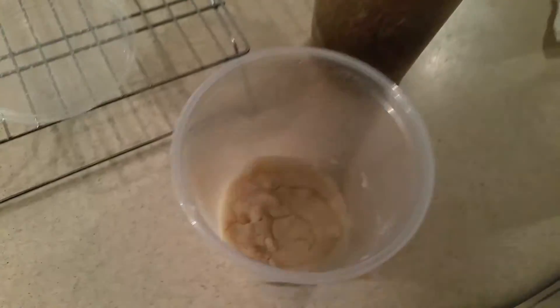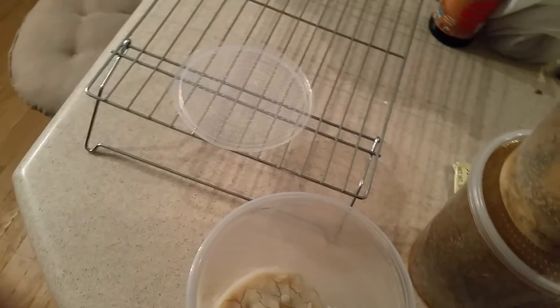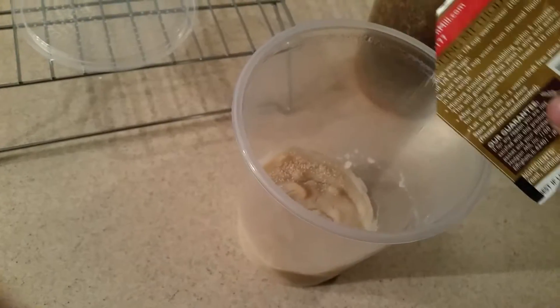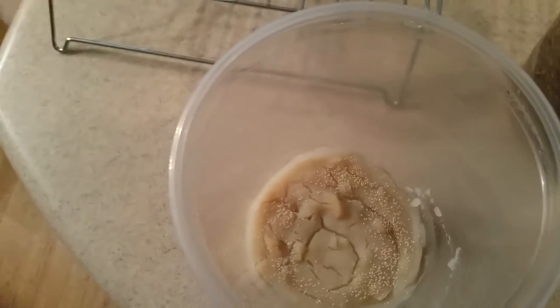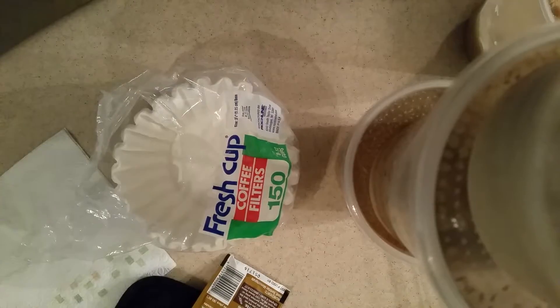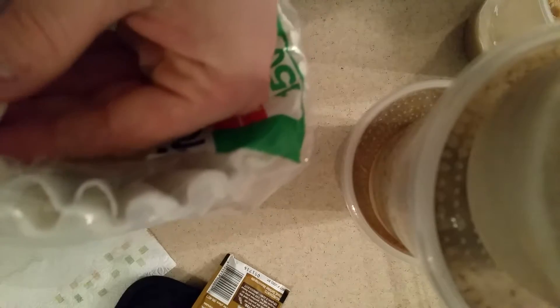Now we have the culture and the lid condensation free. What I do now is I get some active dry yeast and sprinkle it just on the edges, not in the center, because that would be a waste — that's where your coffee filters are going to go.